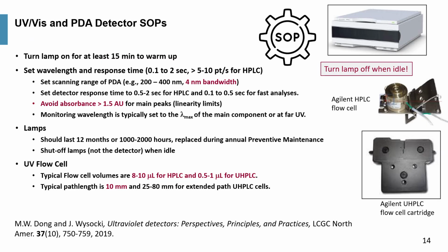Next, the SOP for a UV detector, UV-vis detector, and photodiode array detector. The attendee is really advised, for more detail, to look at this white paper, which was published in LCGC magazine, and you can download it by doing a Google search. It gives you full detail on the best practices, the SOP, on photodiode array detectors, and the design and everything.